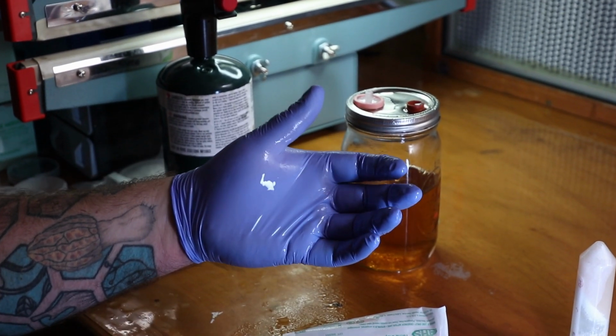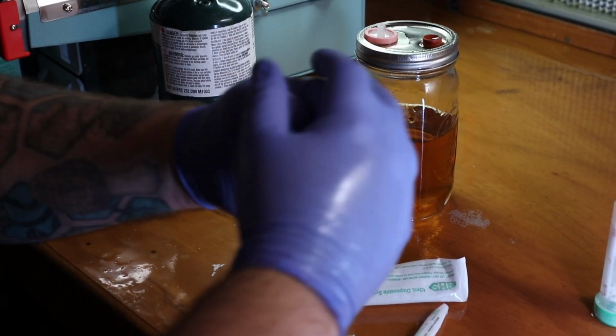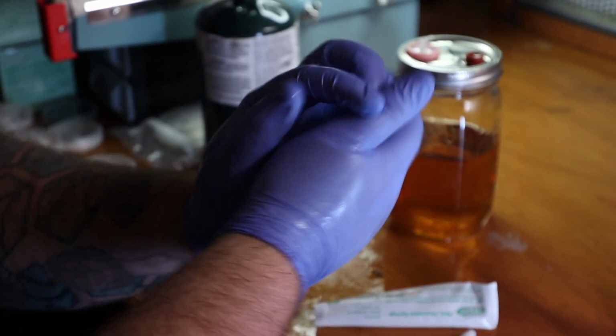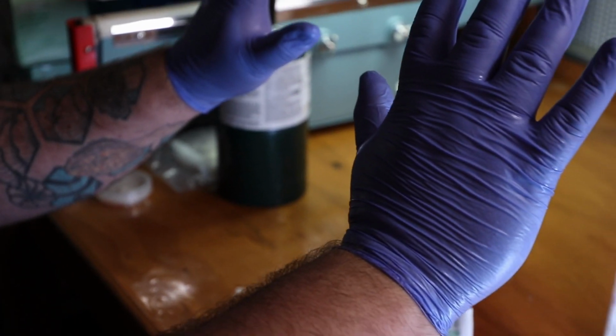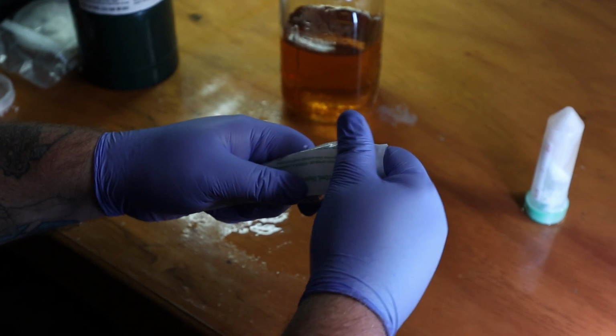And of course, I always like to sanitize my hands in between rounds. So if I start a new culture, I like to sanitize my hands, really get it down in the nooks and crannies, and then dry my hands thoroughly so my hands don't slip while I'm working with a needle.